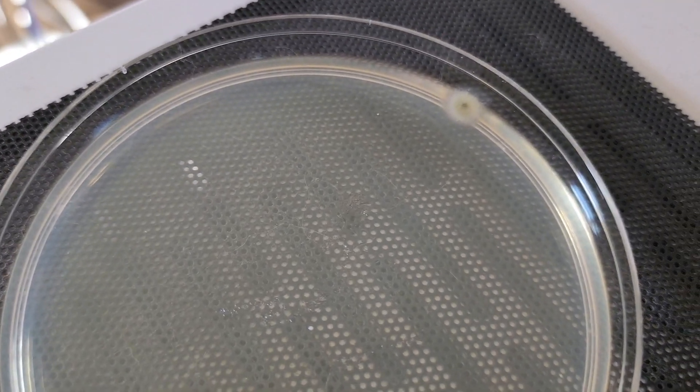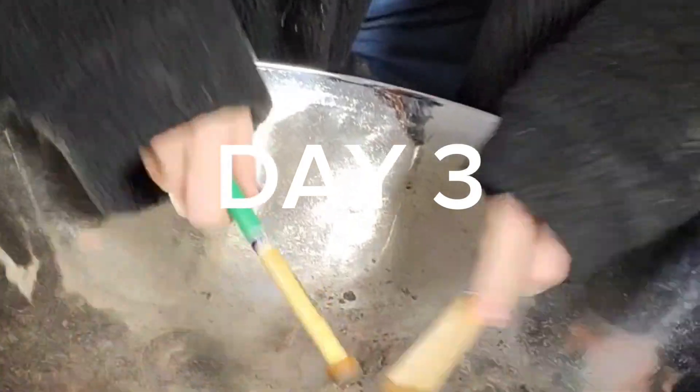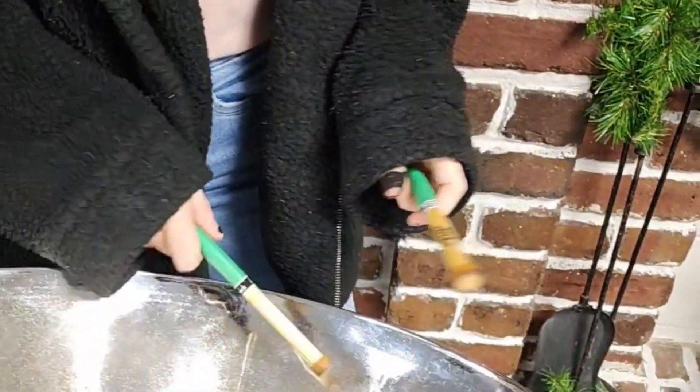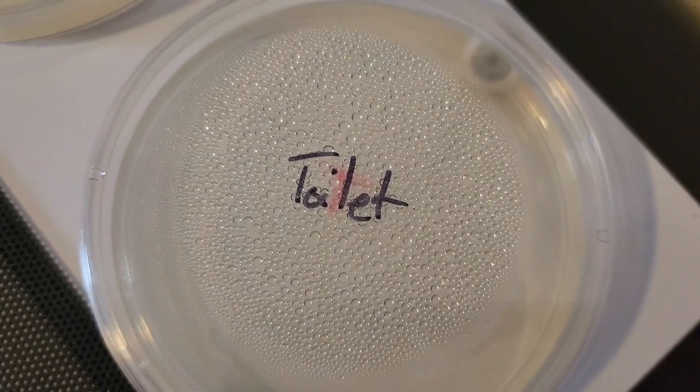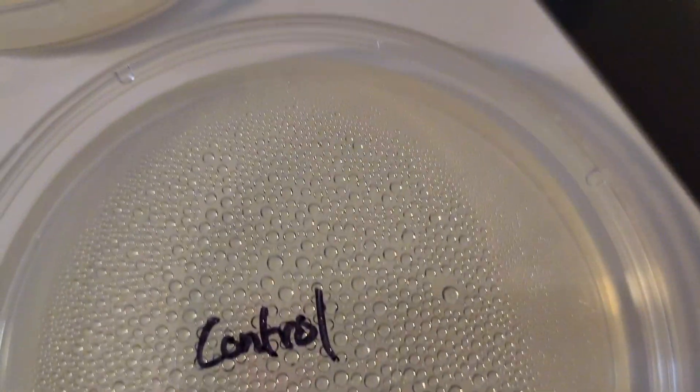Here is day three — the toilet has continued bigger growth, one big old puff. I'm really curious to see what this is and I'd love to talk to an expert about their opinions. Besides the big puff there's not really much else going on, which might be because they clean toilets. The control remains the same, nothing going on that I can see.